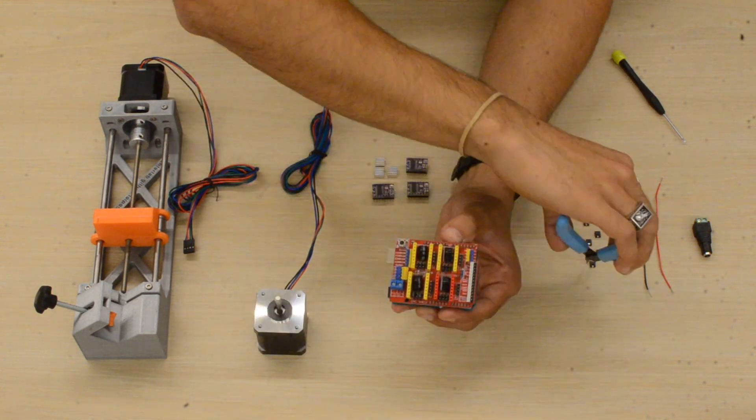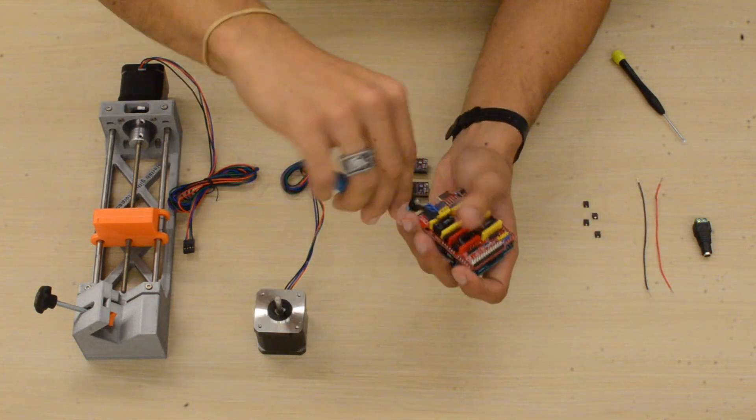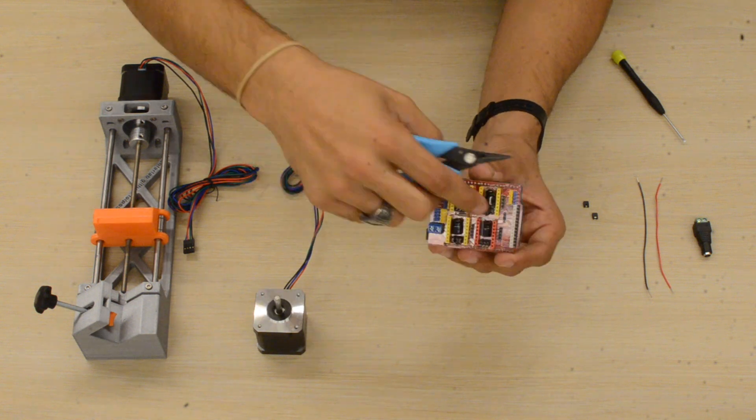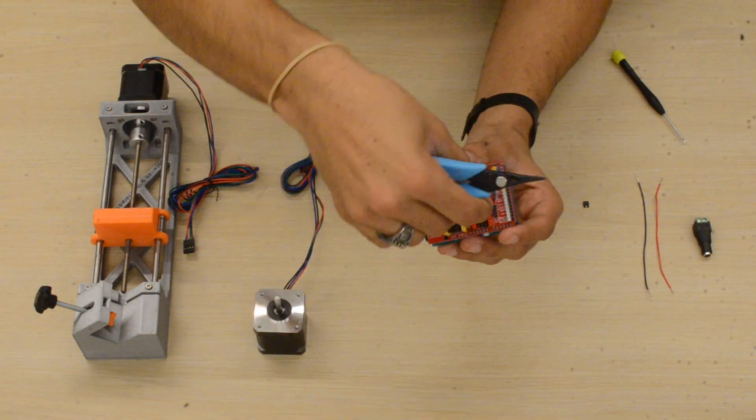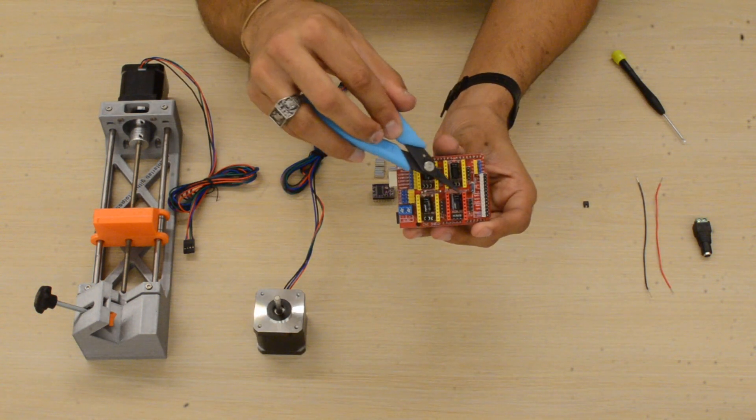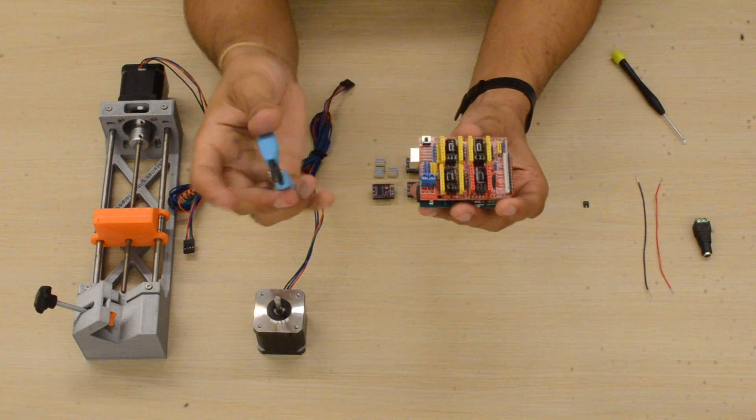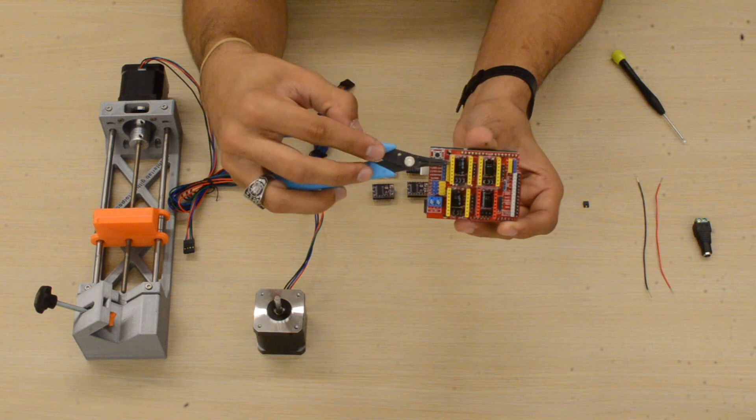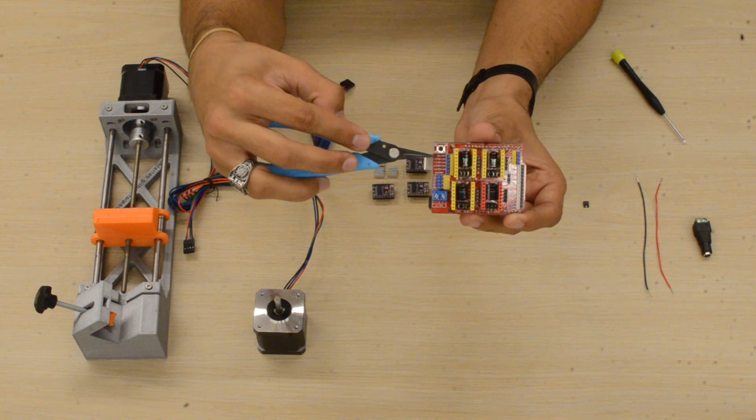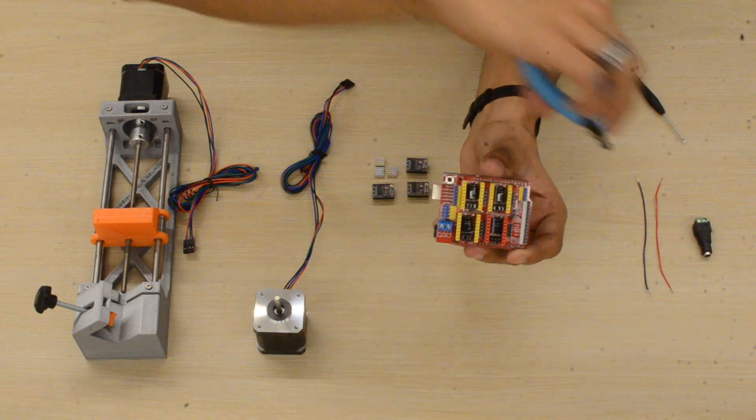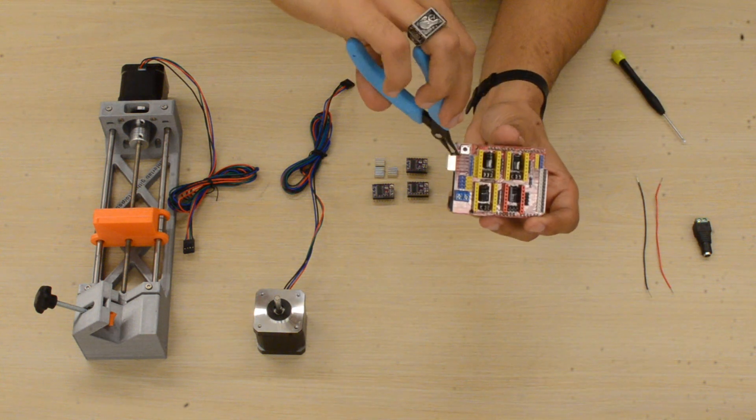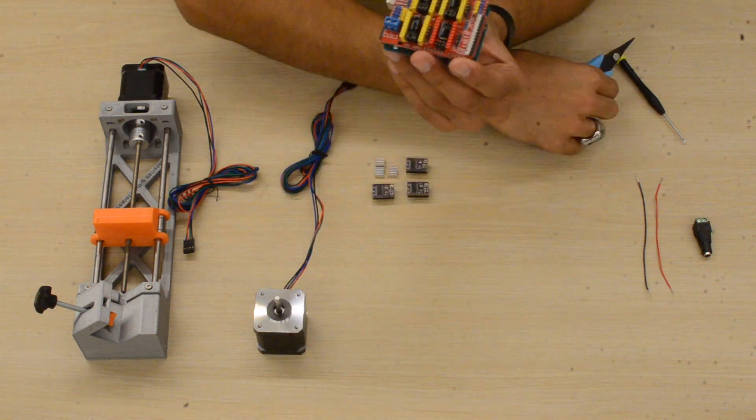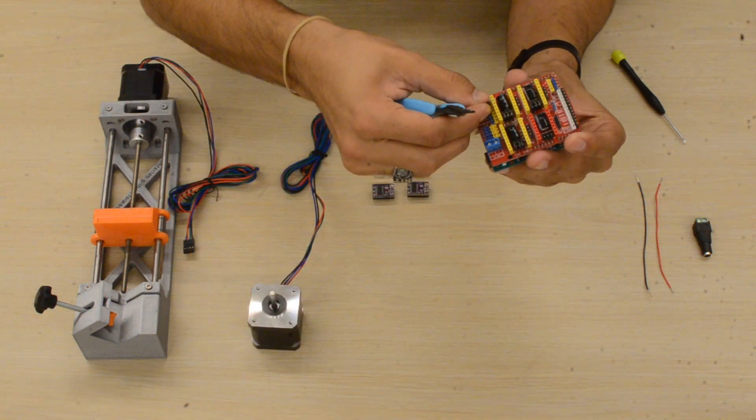We'll do that for all of the motors—three jumpers for each of the three motors. Next, we're going to put a jumper on the enable pin on the CNC shield. This will allow the motors to be automatically enabled whenever we run our software, making it easier. You can think of these pins as switches or decisions, and in our case, we're enabling all the stepper motors to be on.